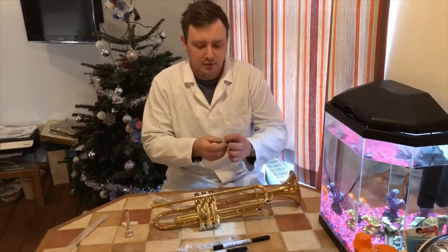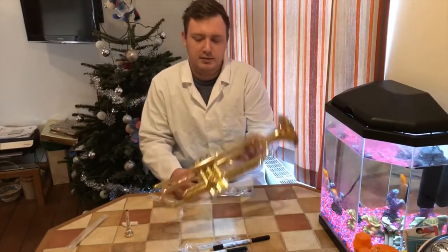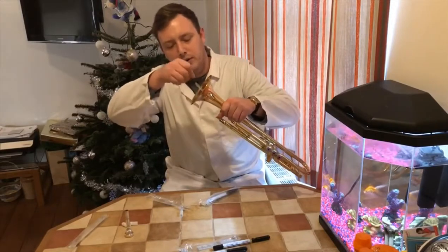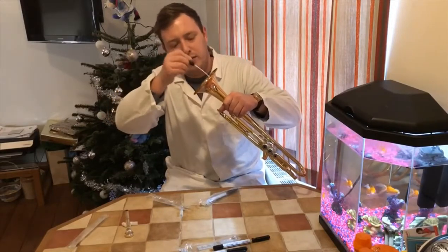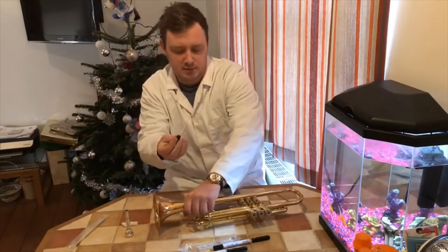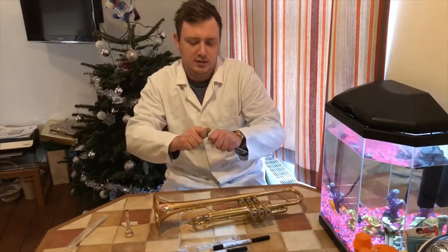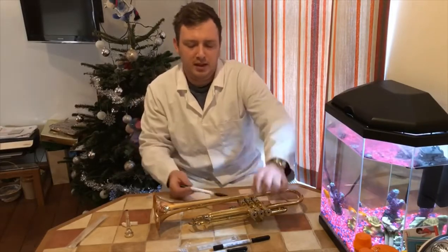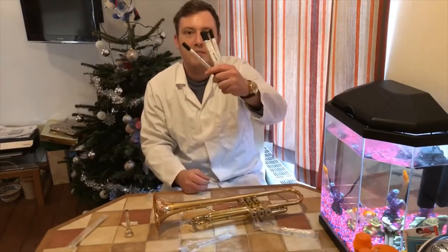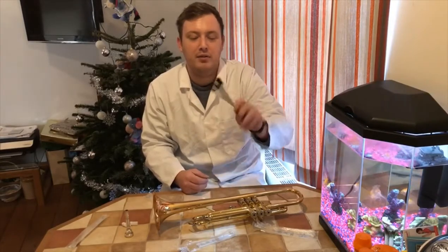And then we've got our final one down the end of the bell. Straight down the end, give it a nice good rub around and try to catch as much gunk as we can. We'll then pop them in their tubes and take them off to the lab, plate them out, and see what we've got.